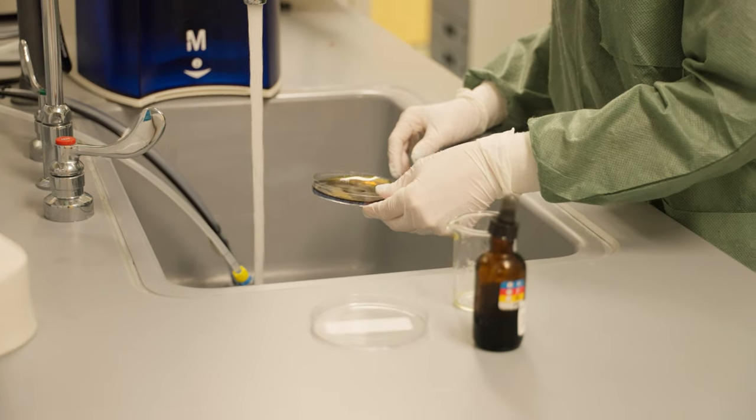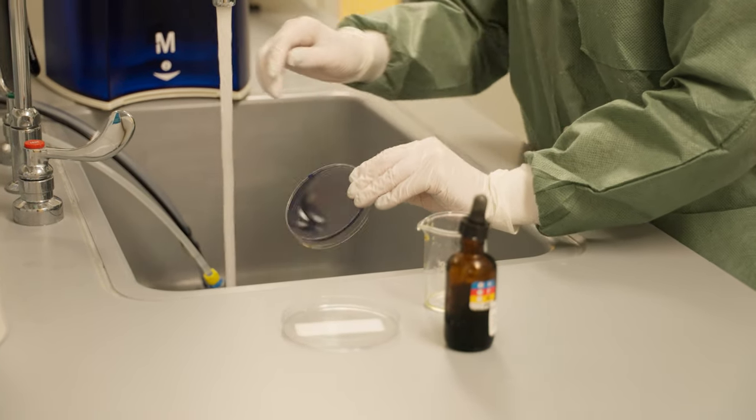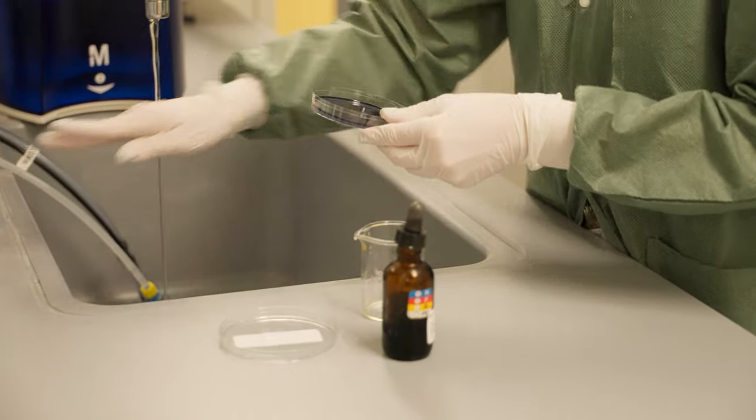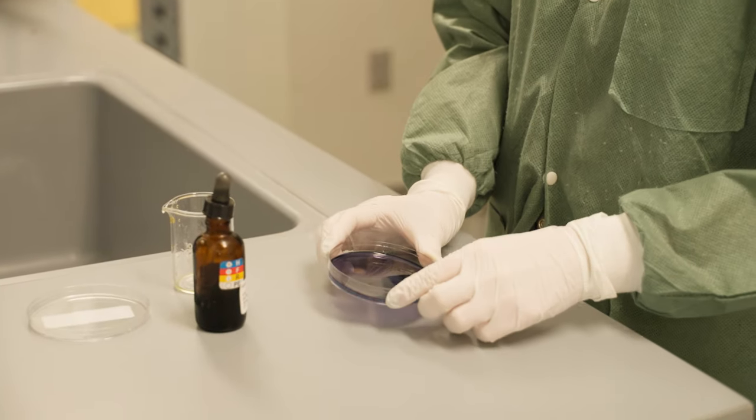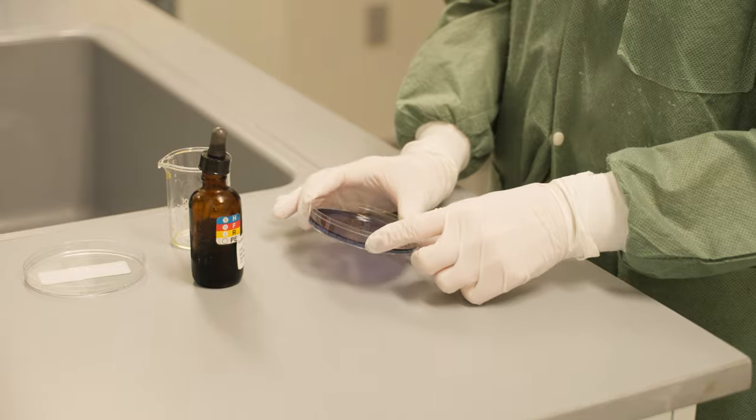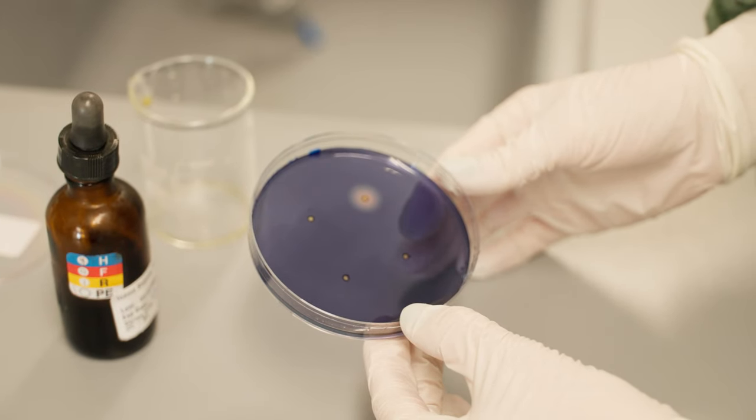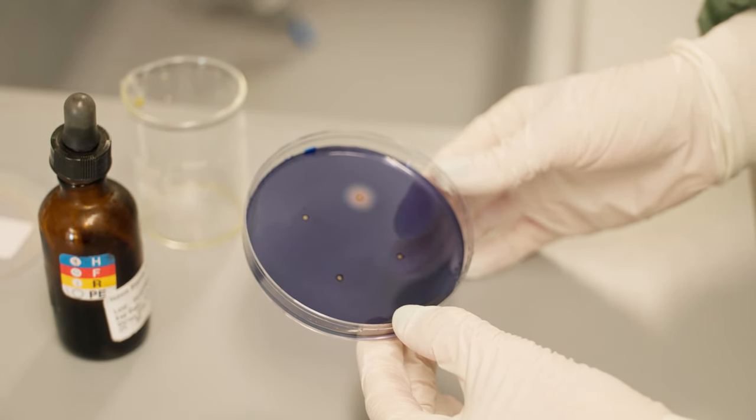A clearing around a well indicates areas of amylase activity. The diameter of the clear circle is proportional to the square root of the concentration of amylase. An approximate measurement of the diameter of each ring present is then taken and noted.